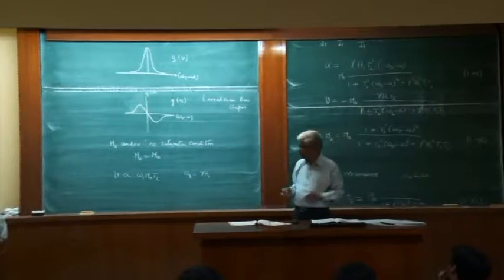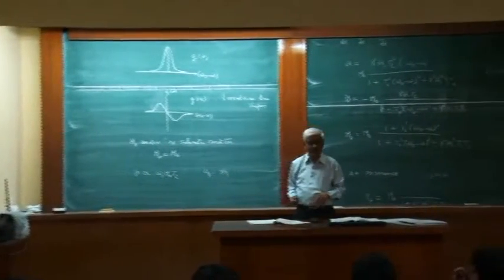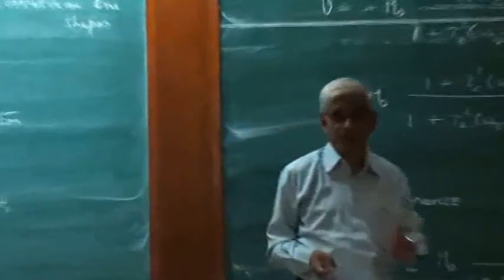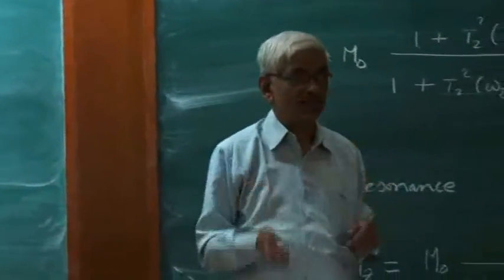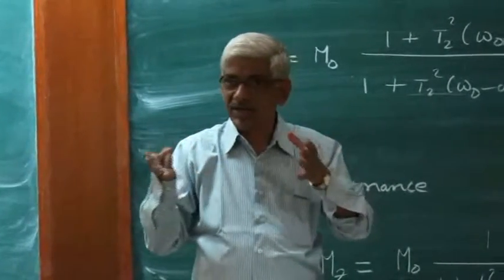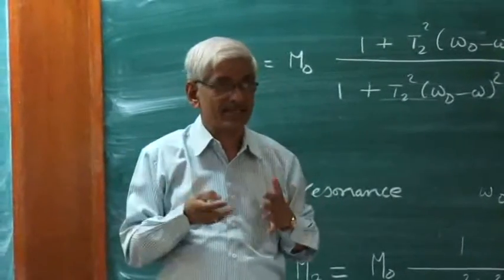So now we move on to the next topic. We will go a little bit more deeply into the relaxation phenomenon. How does the relaxation phenomenon occur? And qualitatively and intuitively, how do we interpret this? How do we understand this?